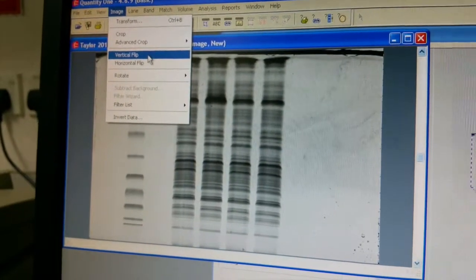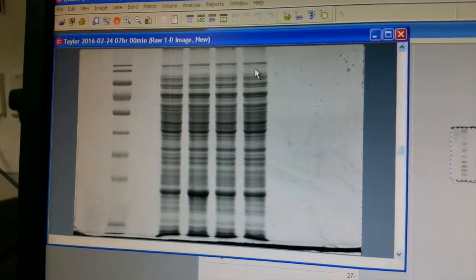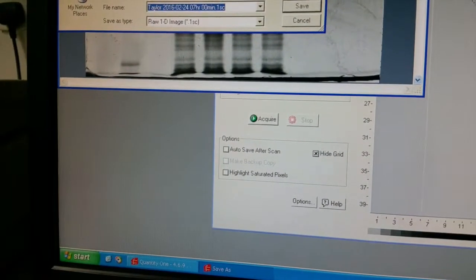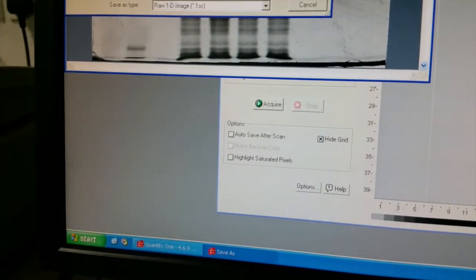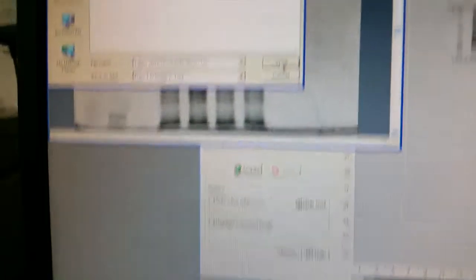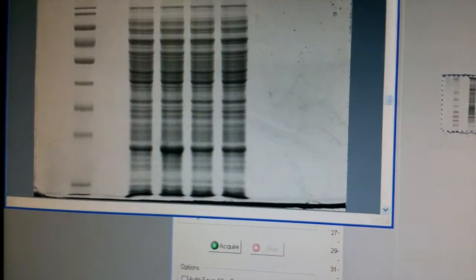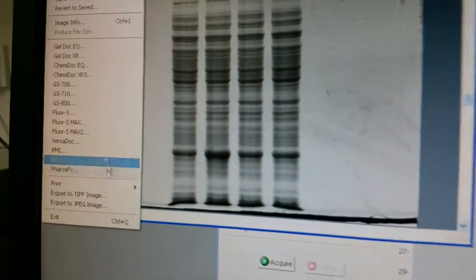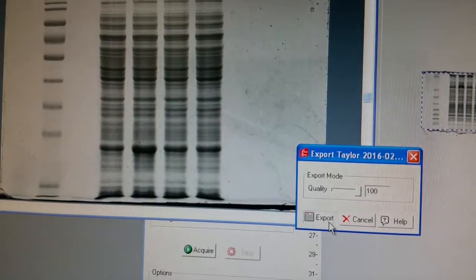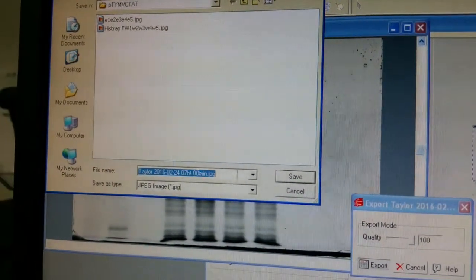After flipping, go ahead and save with Ctrl+S. It will give you a file with the .1sc extension — that's the native format. Go ahead and save it. If you want a JPEG, go to Export JPEG. It will ask you for quality — pump it up to 100%. Press Export and it will give the file the same name you just used. Go ahead and save it.